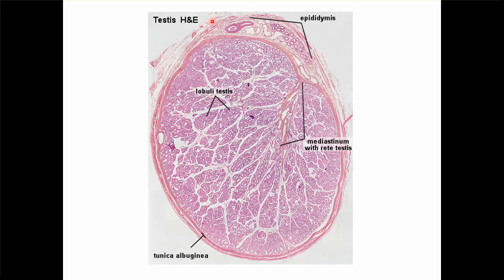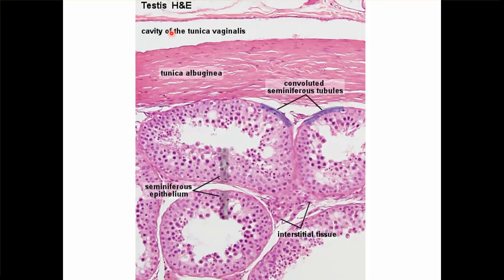The entire section of the testis also includes a part of the epididymis. You can see that it is covered outside by the tunica albuginea. The outer layer is tunica vaginalis, and towards the middle you can see the mediastinum with rete testis. All these are the different lobules with the seminiferous tubules inside.